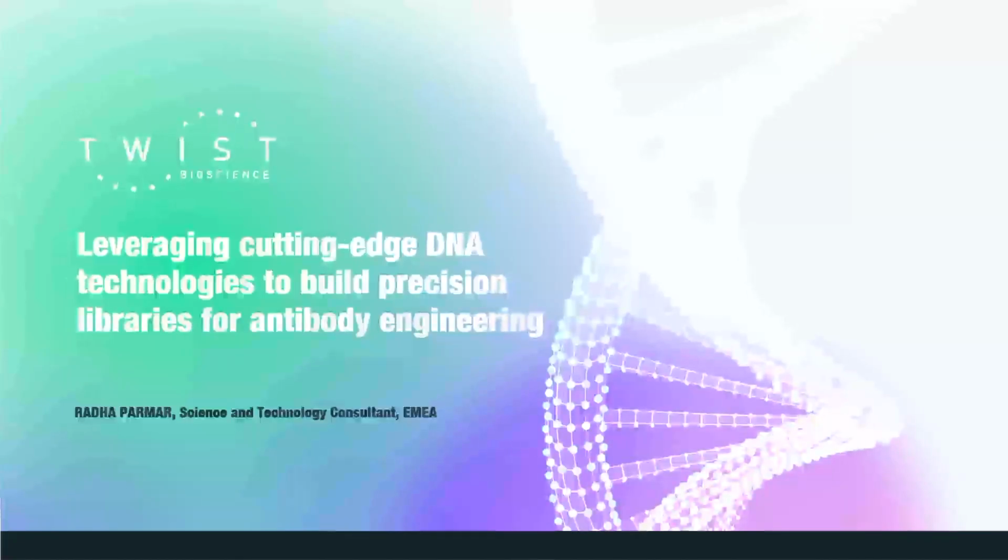I'm going to talk to you about how we're really using our DNA tech at Twist to build these antibody libraries, precision antibody libraries, and how we're really leveraging that DNA tech.